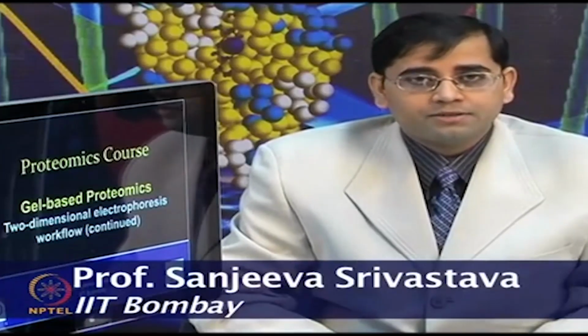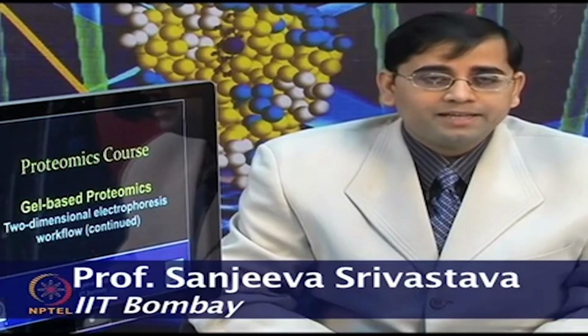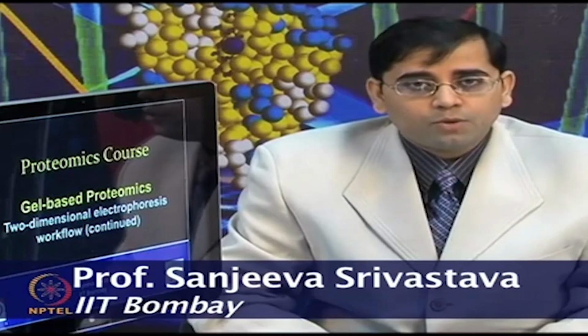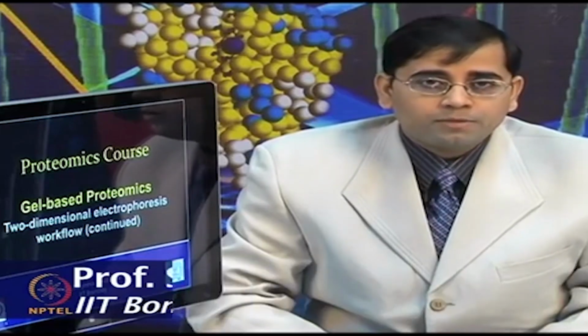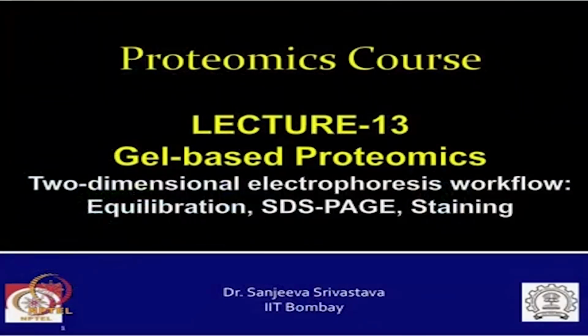In the previous lecture, we started discussing gel based proteomics. In that workflow, we talked about two-dimensional gel electrophoresis, and there are different steps which are involved in performing it.